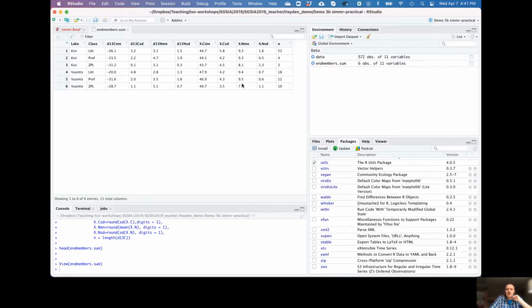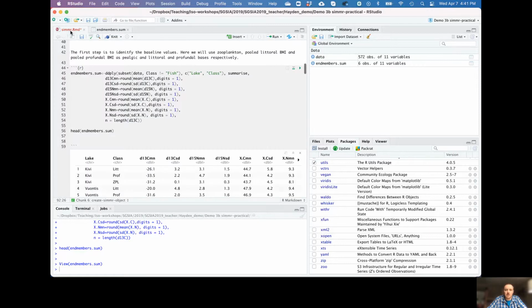I'm not going to go through in great detail the theory behind what we're doing here. We've covered that in the lectures, or, depending on the time you're viewing this, we will cover that in the lectures. And I don't want to overburden you with information right now. So right now we're just going to work through the mechanics, the nuts and bolts of how this works.